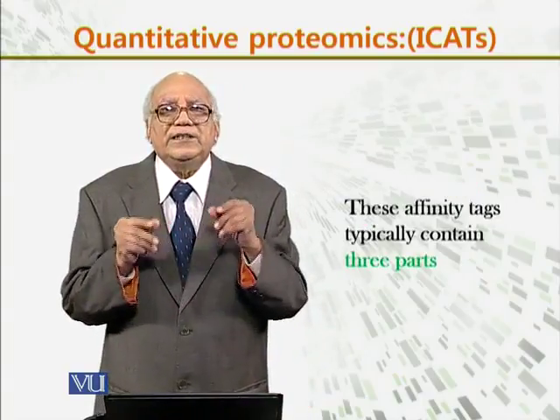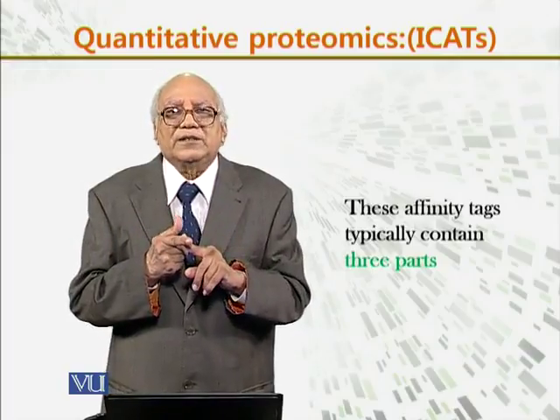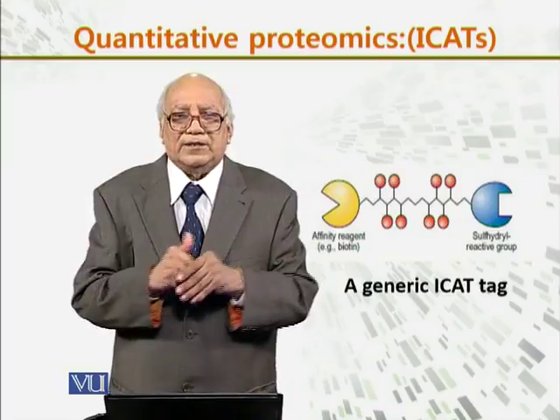Now, these affinity tags typically consist of three parts.